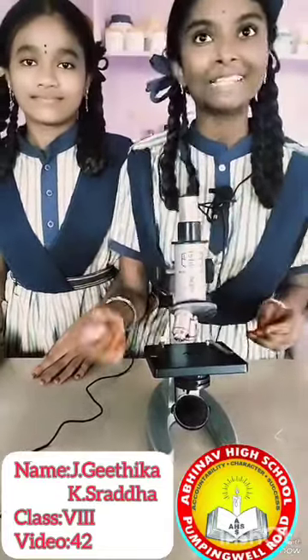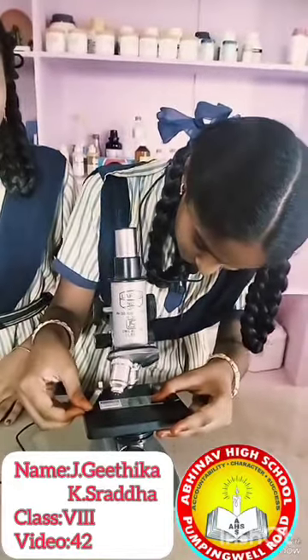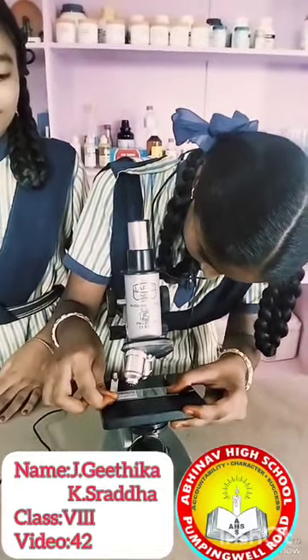I am proving it as an experiment. This is a monocot stem, TS of the inner part of the stem. Now I am placing it under the microscope with the help of the slide holders.